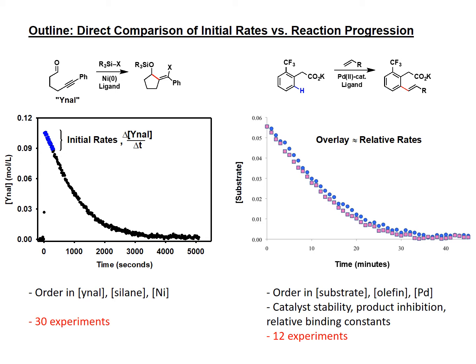But just to get that information, using the method of initial rates, took 30 experiments. And that's 30 experiments that just go into the data to get that information, not any sort of troubleshooting or just generating how I'm going to study this reaction in situ. And so you can already see where my biases lie, right? Compare that to reaction progress kinetic analysis.